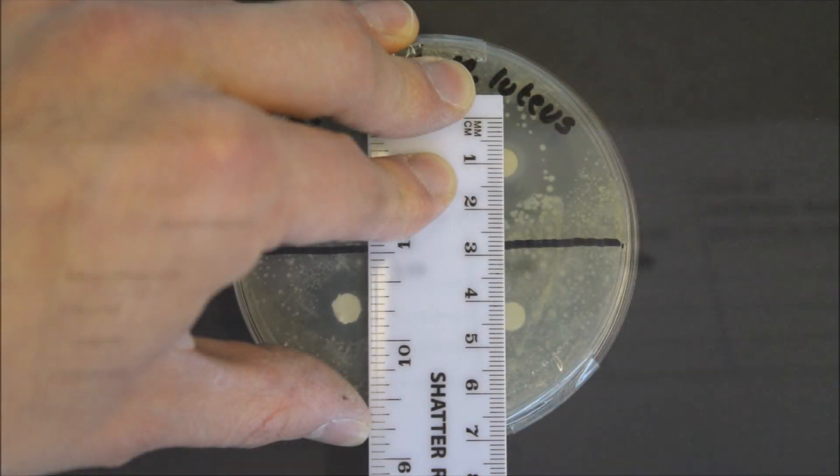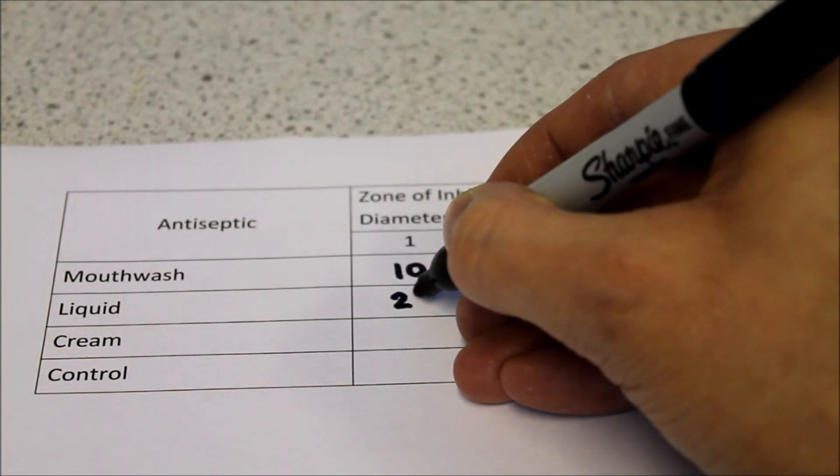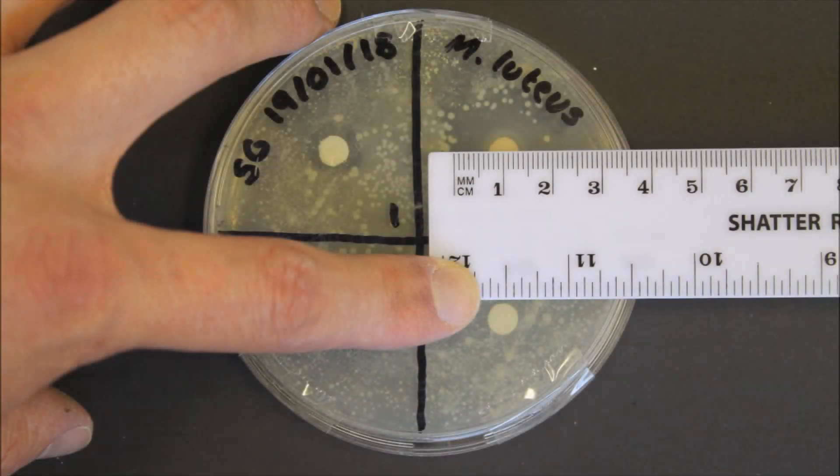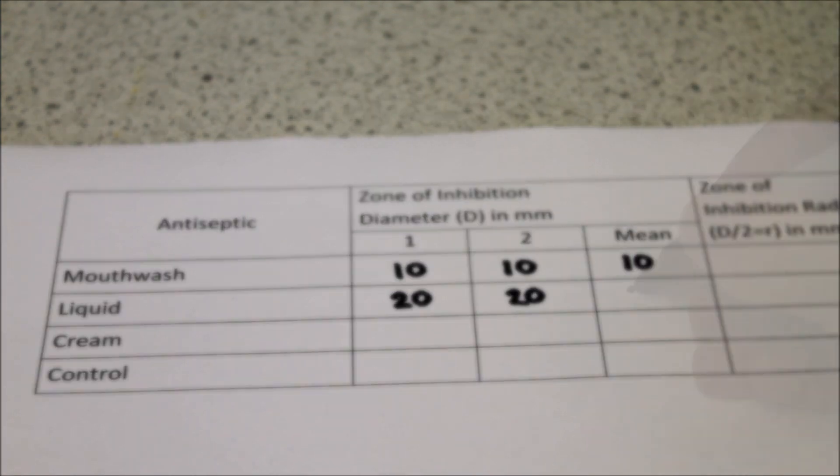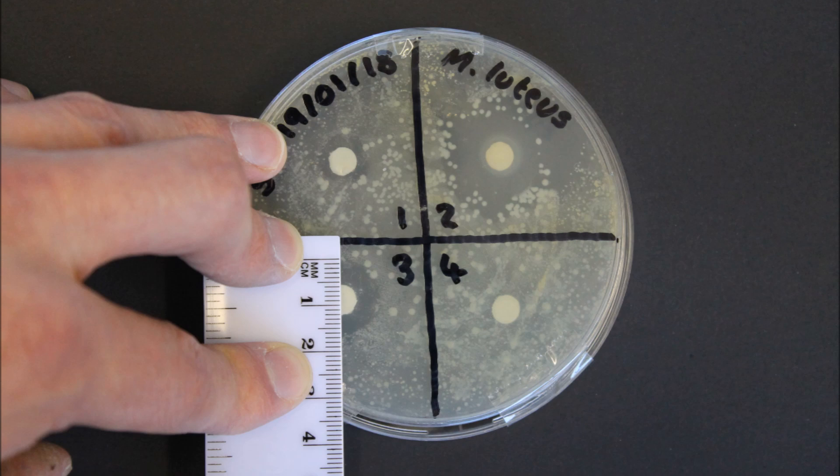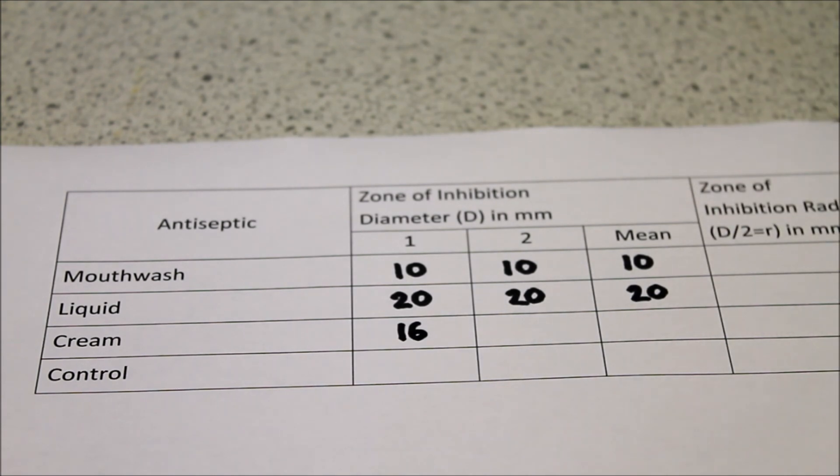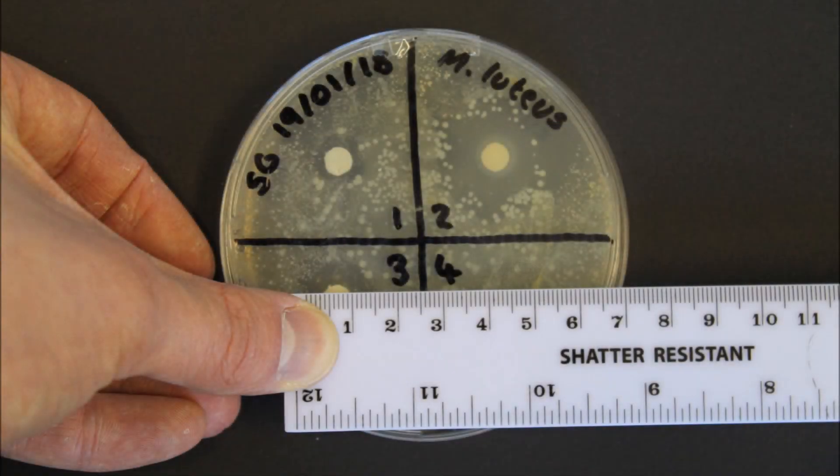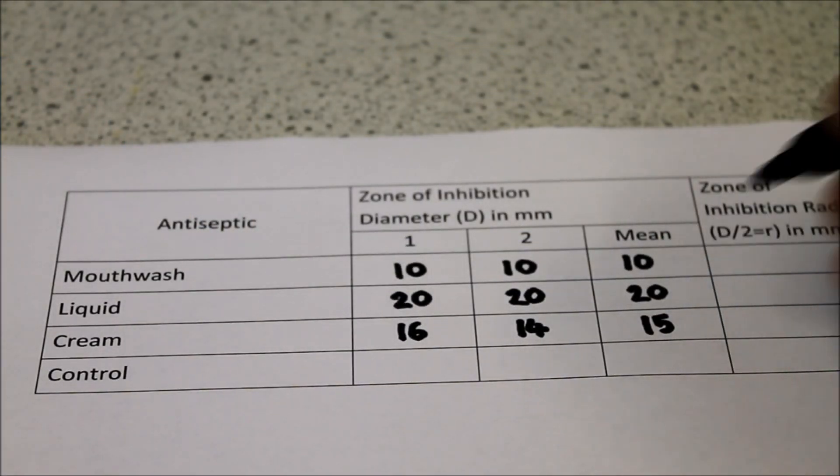The zone of inhibition is much bigger for this second antiseptic with a diameter of 20 millimeters from top to bottom and 20 millimeters across. Again the average is the same. The zone of inhibition for this third antiseptic measures 16 millimeters vertically and 14 millimeters horizontally. So the mean average diameter is 15 millimeters this time.